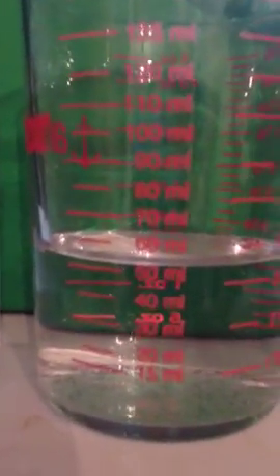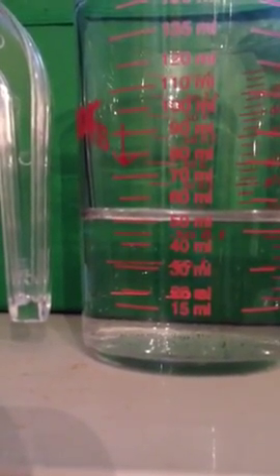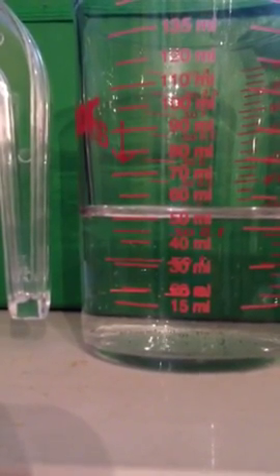So here's our next container. This holds a maximum of 150. And we have to come down to eye level. This is broken up into groups of 10. And it looks like there's just about 50 milliliters. So I'm going to estimate, because it's broken up into groups of 10, if we carry it out one more place, which is what we do when we're estimating, you can estimate to the nearest ones place. It looks to me that it's right on the dot, so instead of saying 49 or 51, I'm going to say 50 milliliters. So I'll write that down.